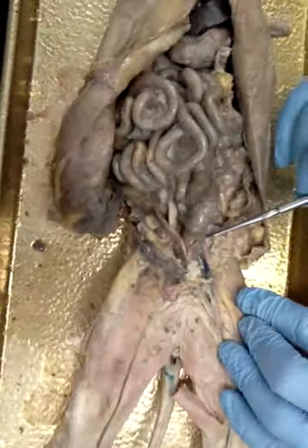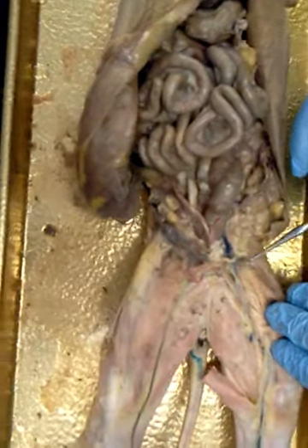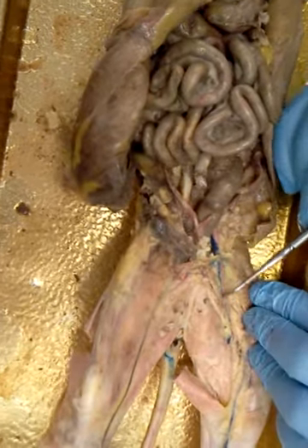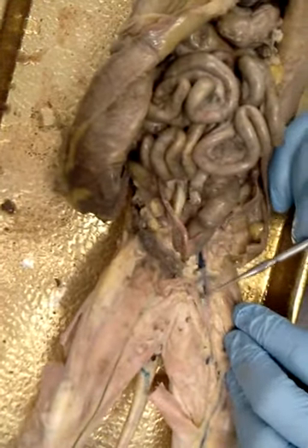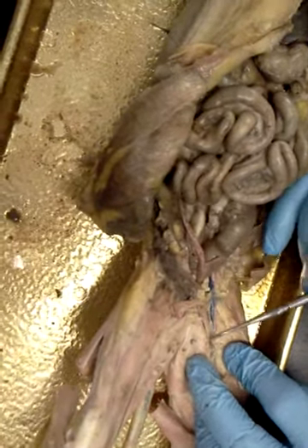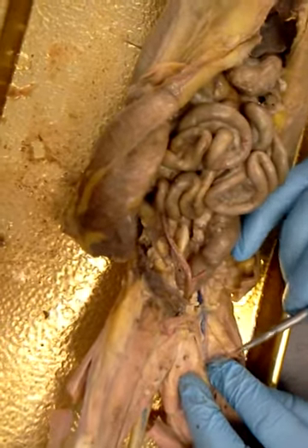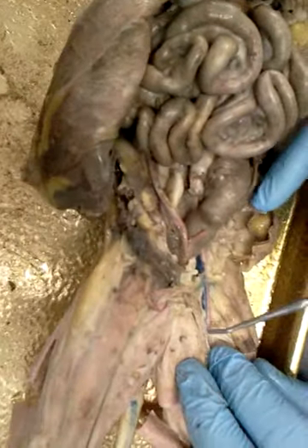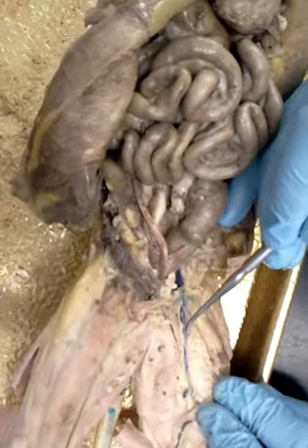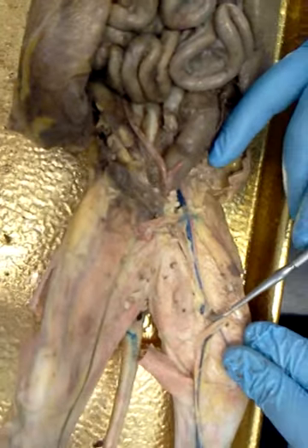Then that's going to branch down to the femoral, and then there's the deep femoral, if I can find it. It will branch off to the deep femoral right here. See that artery right there? It's branching off and going down deep. Right there. There's the deep femoral. Once we get past all of that is femoral right here.